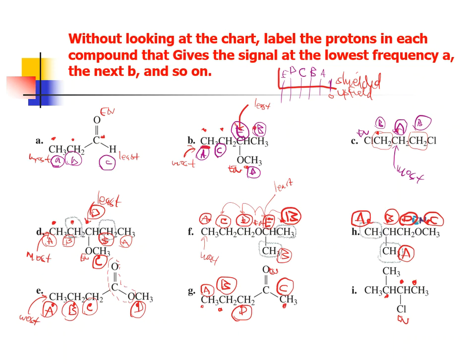And now we're going to look at the last methyl group, and you need to say, okay, is this methyl group different than the other methyl group that we did? This CH3 group is on a CH with another methyl. This CH3 group is on a CH with no other methyl. So yes, ding dong, they're going to be different.